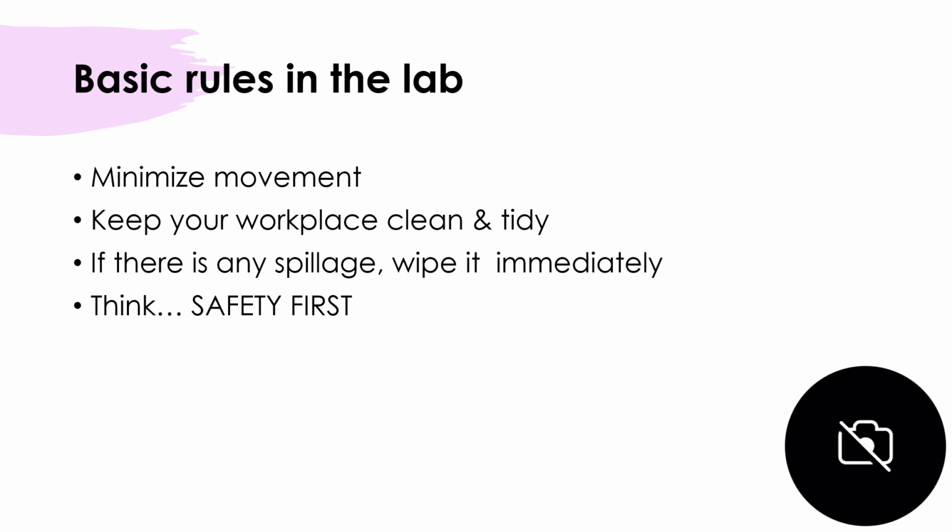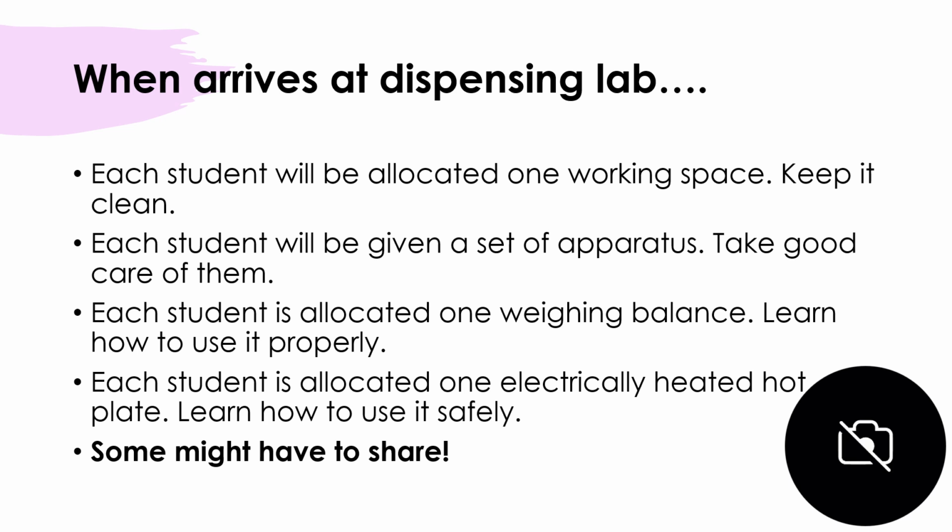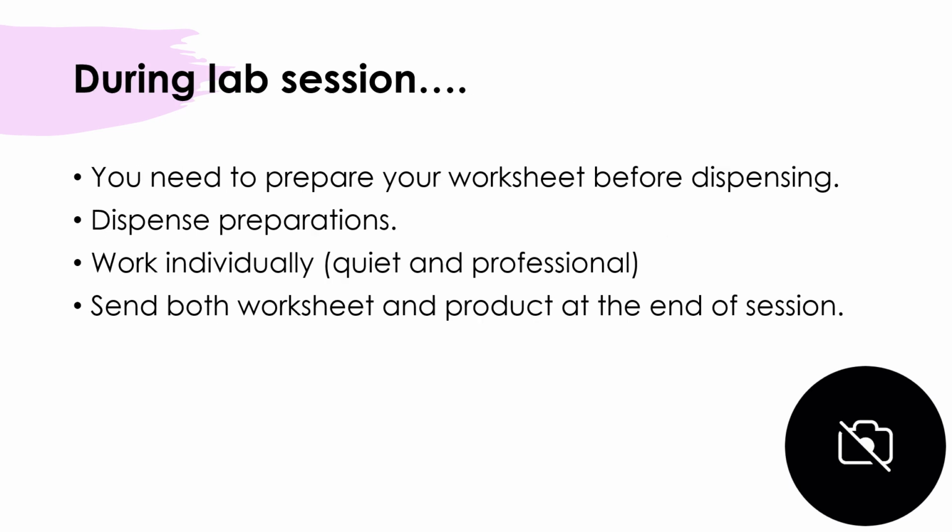During compounding, make sure you minimize your movement, work in clean and tidy manner. Whenever spillage occurs, always wipe it cleanly. Safety first is our mantra in this case. Whenever you arrive in dispensing lab, you will see that you have your own working space, apparatus, some weighing equipment, as well as hot plate for you to compound the medicine. Learn how to use them and use them safely. Remember, some of you might have to share because of limited availability.